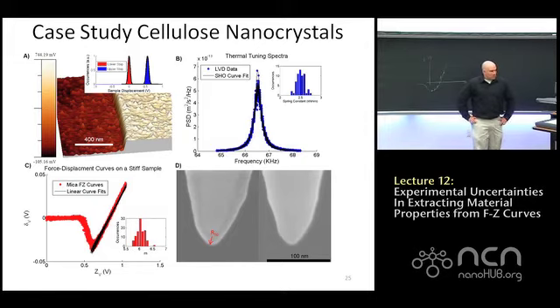So, to recap our relative uncertainties for this particular experiment. This is just a case study that I've done, writing a paper on currently. Our uncertainty in CZ was about 10%. Our uncertainty in KL was about 5%. Uncertainty in M was about 3%. And our uncertainty in our tip was about 10%. And notice this is only the aleatory uncertainty. I haven't talked about the fact that the DMT model is not perfect. Turns out that's a much more complicated issue to address.